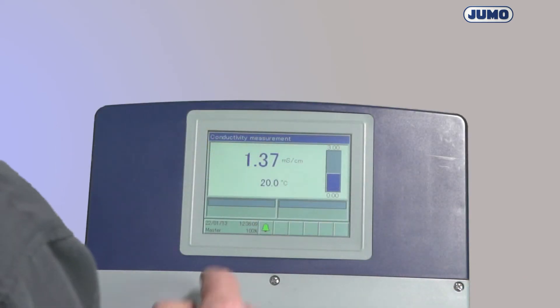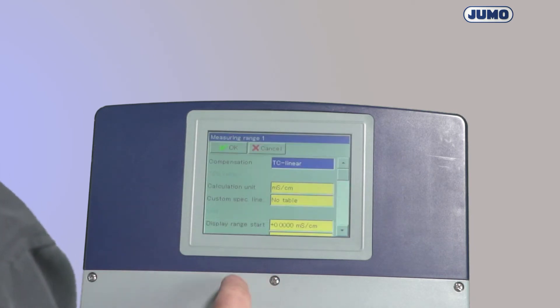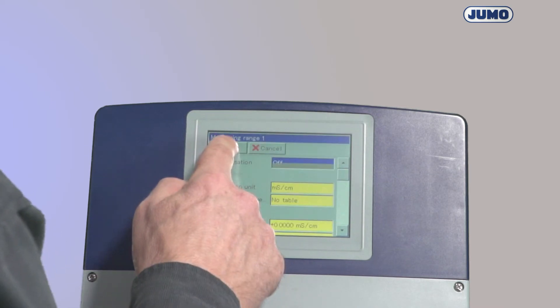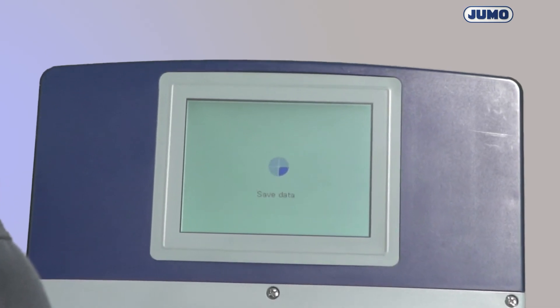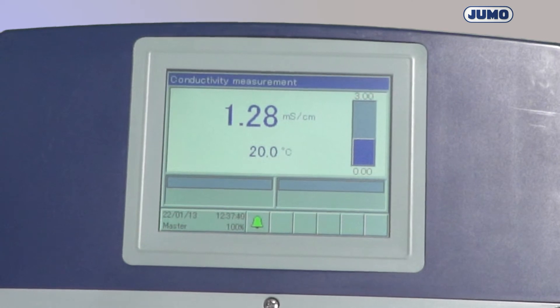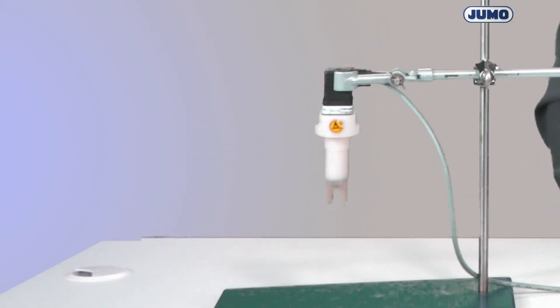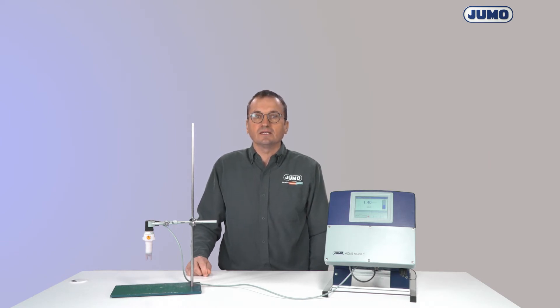The back calculation to 25 centigrades is done by the so-called linear temperature compensation. To determine the temperature behavior of the process solution, I now temporarily switch off the compensation, and the transmitter displays from now on the actual conductivity of the measurement solution. I no longer need the test solution, but I still want a reliable reference. That's why I don't pour it back into the bottle, but discard it. From now on we will work with a measuring solution, by which I mean the liquid from the process.